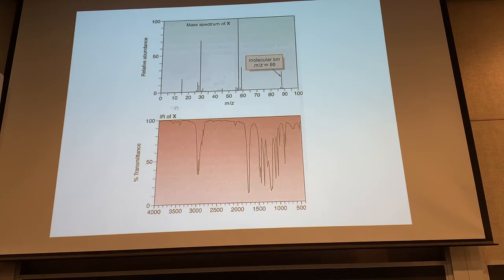And then there's the IR spectrum also here. And you can see a lot of frequencies down here in the fingerprint region. Remember down here below 1200 inverse centimeters, what's that? That's the bending region, the bond angle bending region. And those are coupled to a lot of other harmonic events or vibrations in a molecule. They can be very diagnostic. It is unique for an individual compound, but it's difficult to interpret to say what functional groups may be present only looking at this region down here.